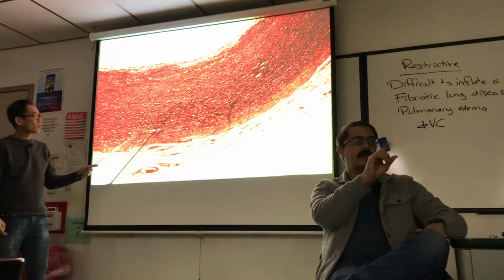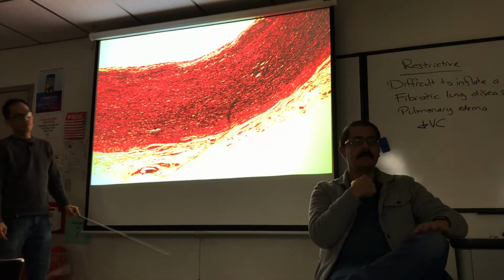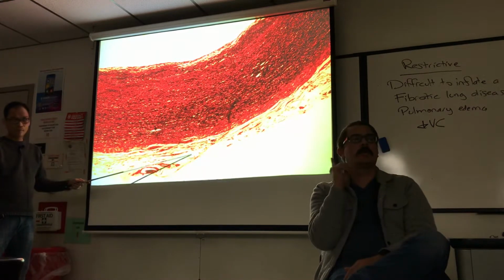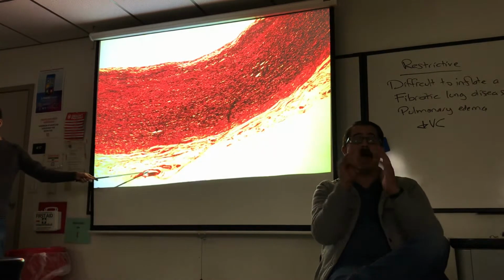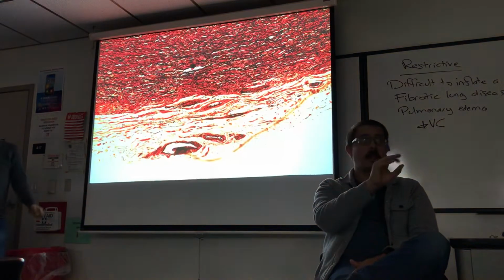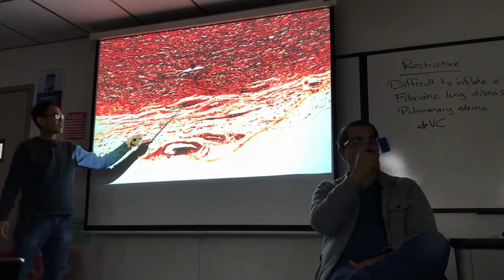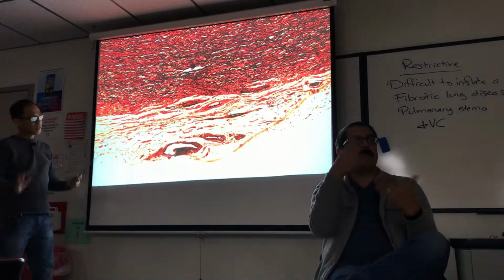The pink or reddish ones, smooth muscle. The content of tunica adventitia, collagen fibers. I may ask you to identify vessels of the vessel, the vasa vasorum. The little blood vessels that are the blood supply to these outer layers of cells. So that's an elastic artery.